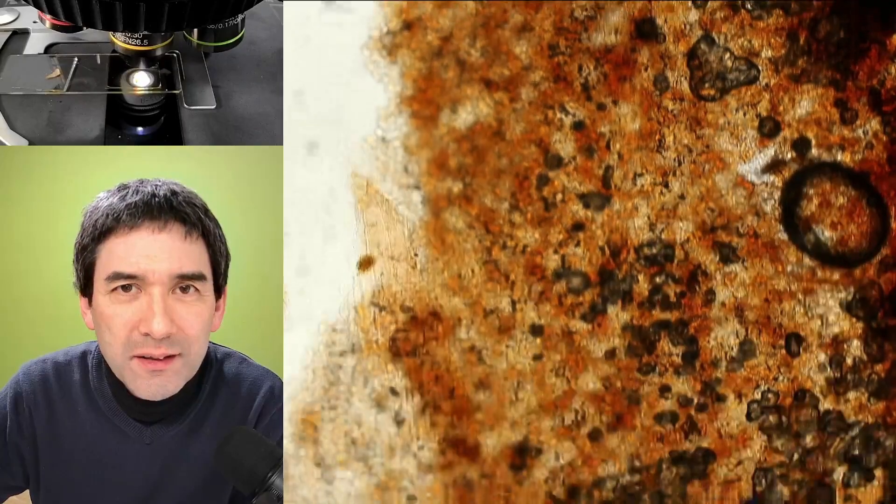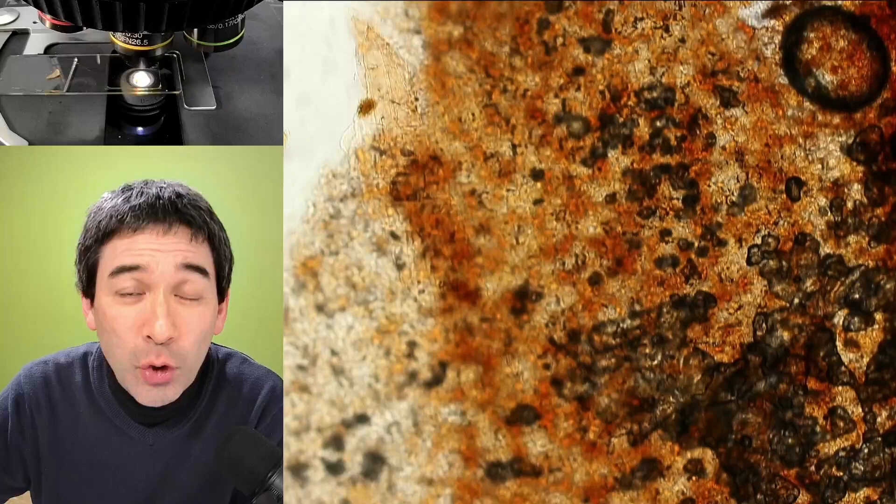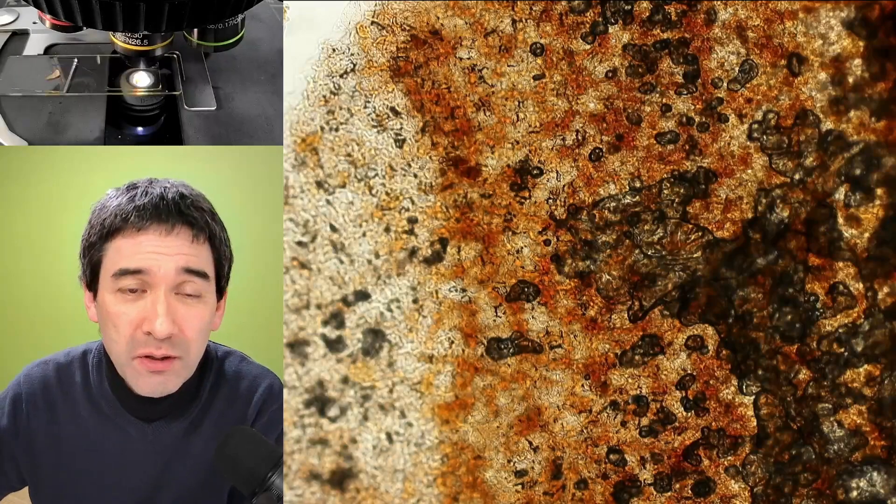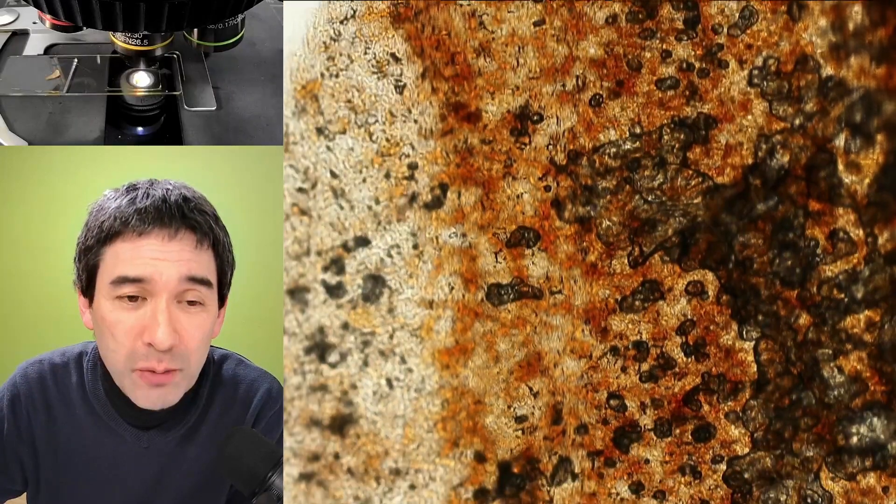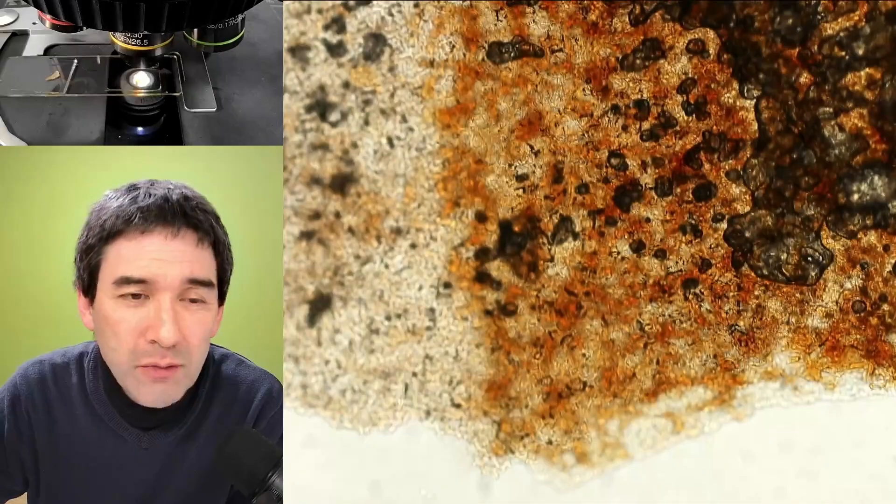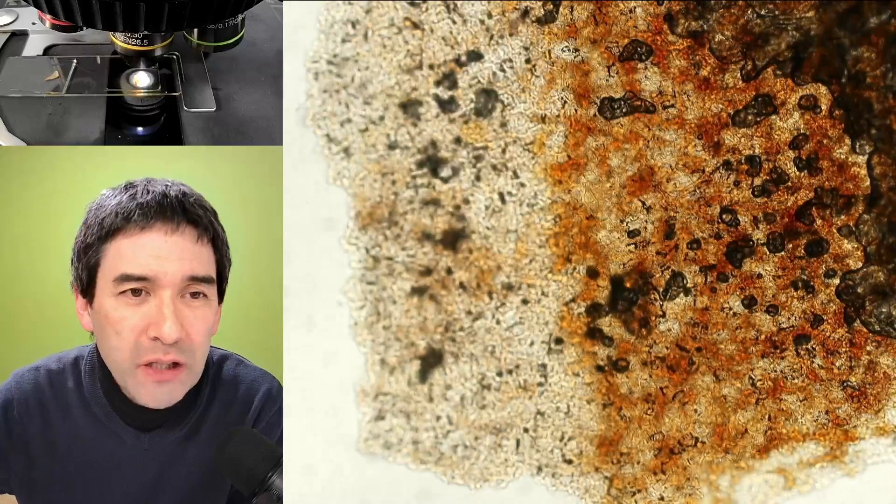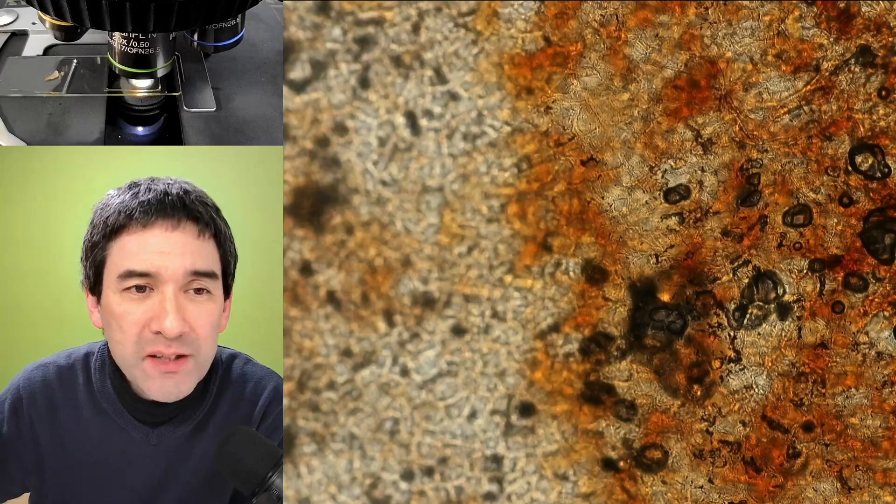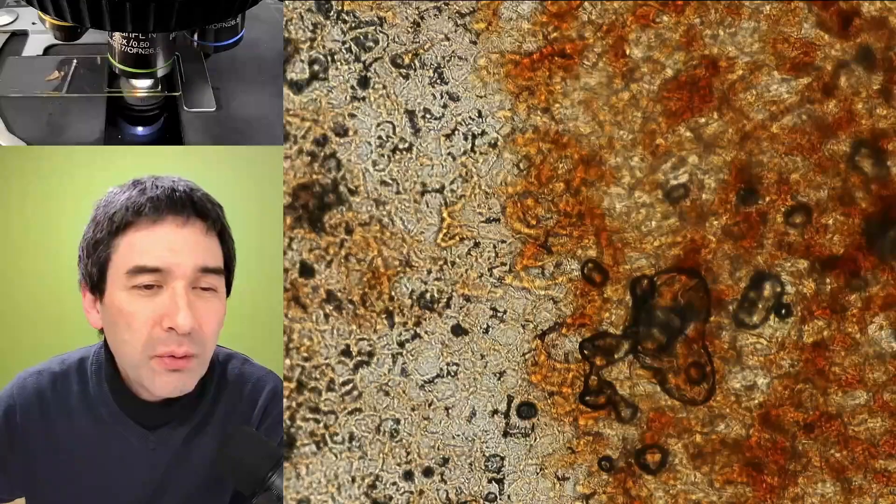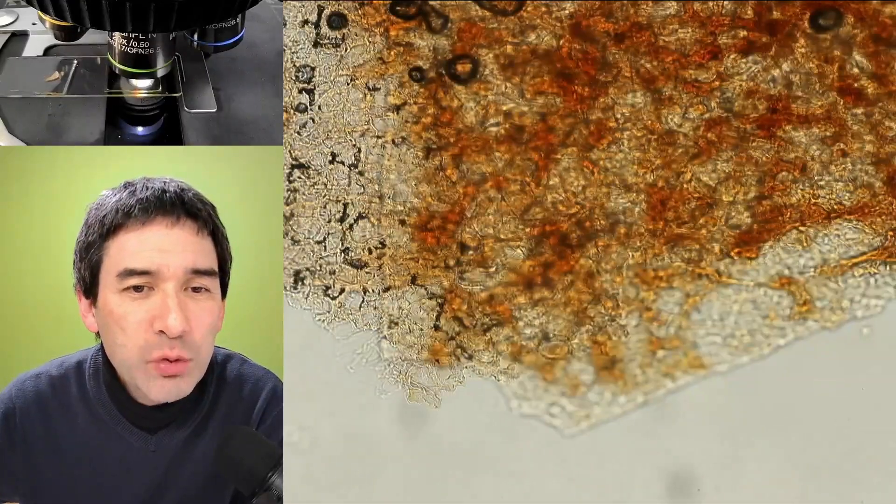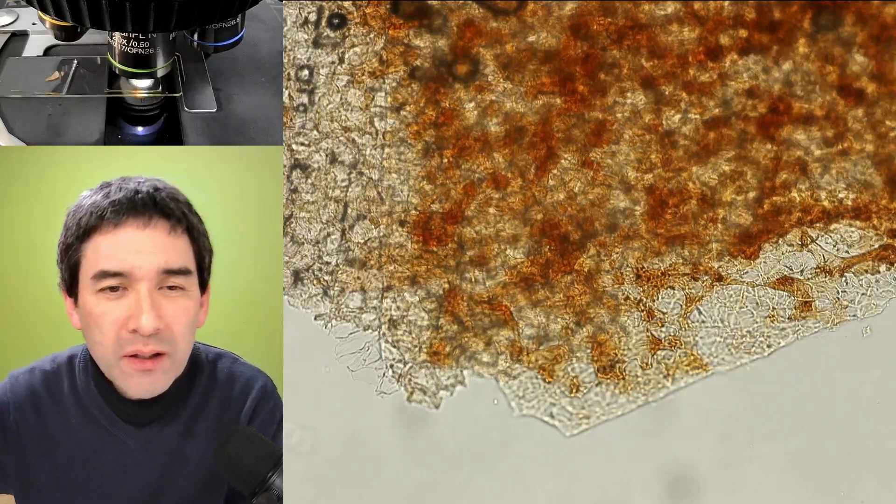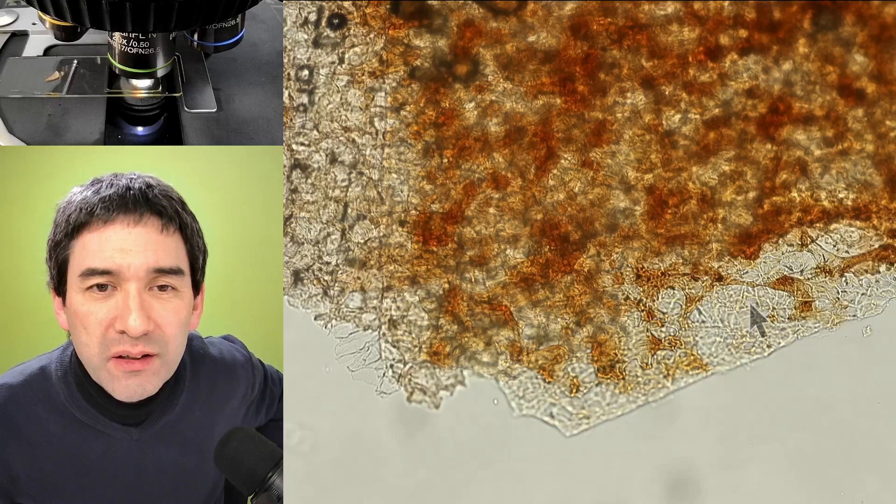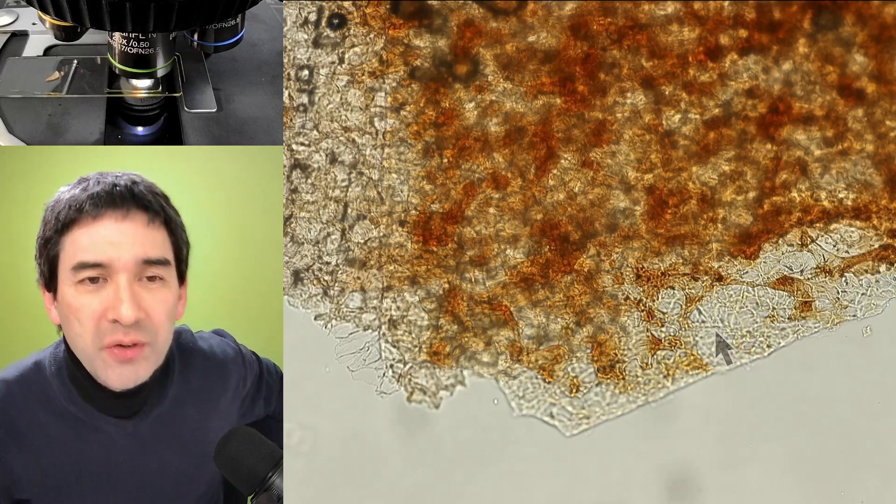This here is the seed coat, the peanut seed coat using Upro, the one with the solvent under the microscope. You can see that here on the right side there are darker regions. These are some air bubbles. Here we're right at the edge. I know it doesn't really look like a lot. We might want to go up with the magnification, but that's not really my point. Occasionally you can see maybe some individual cells as well. They're kind of small and tiny. Let me turn on the arrow here. You might just be able to see some tiny cell walls here on the side.